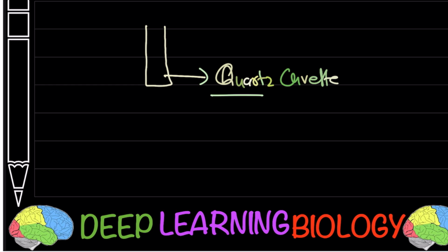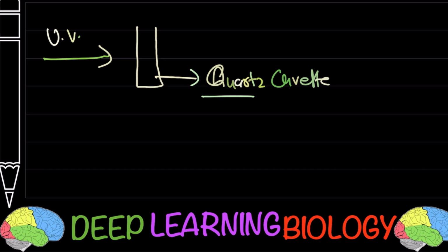So here you are going to have your initial bombardment of UV light. The UV light will come and pass through the quartz cuvette, and within the quartz cuvette you are going to have your sample, and what amount of light it is going to absorb, that you will see with the help of the spectrophotometer.